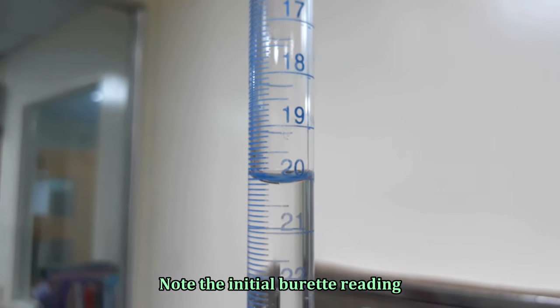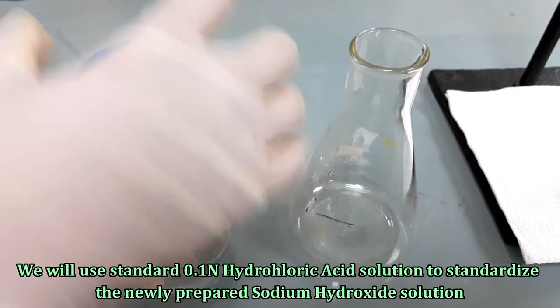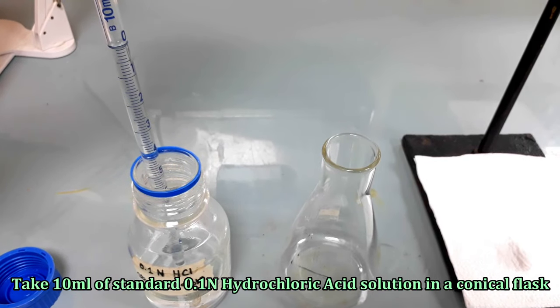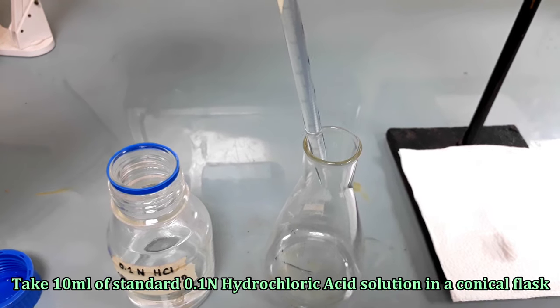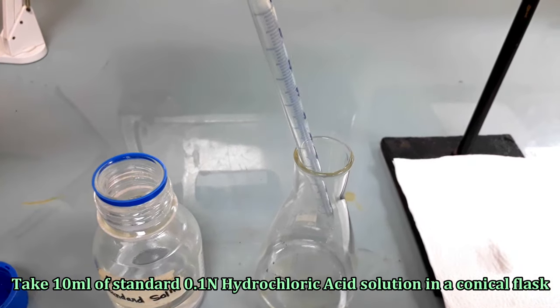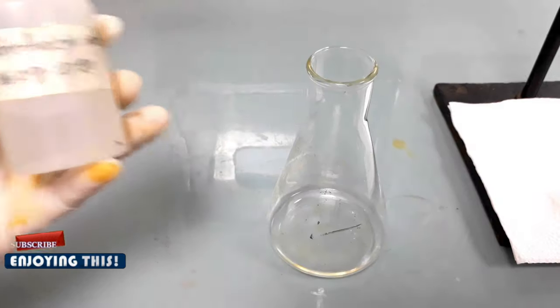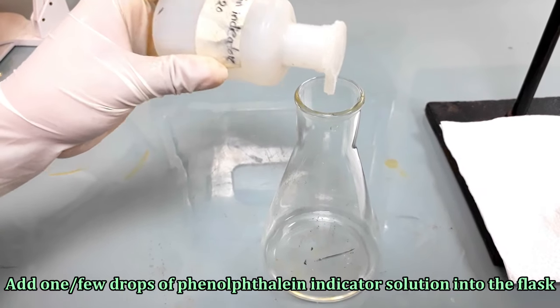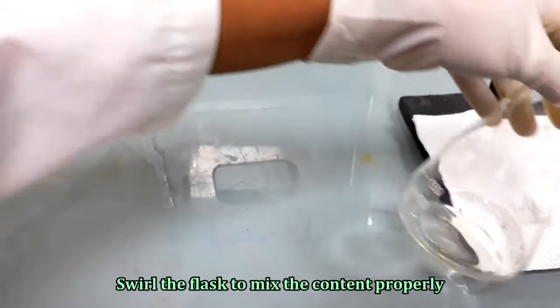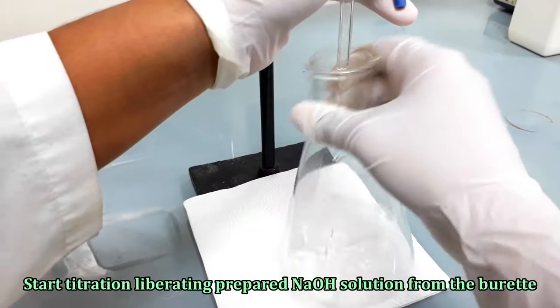Note the initial burette reading. Take 10 ml of standard 0.1 normal hydrochloric acid solution in a conical flask. Add 1 drop of phenolphthalein indicator solution into the flask and swirl to mix the content properly. Start titration, liberating 0.1 normal sodium hydroxide solution from the burette.